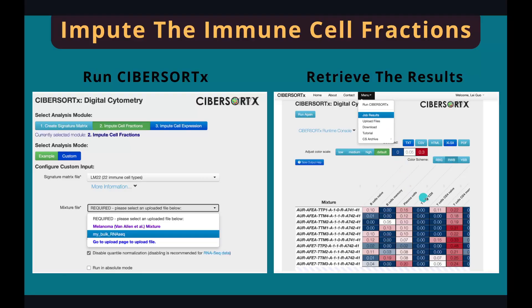The proportion of cells are stored in a table in this format. The numbers are the proportion of the cell type in a specific sample. The table can be downloaded in various formats.